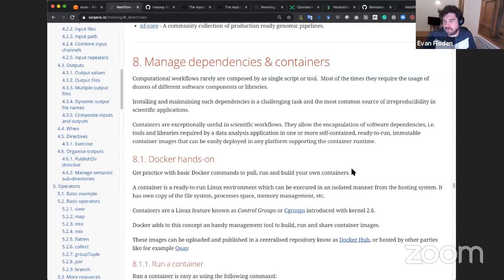When you run from GitHub, it's actually good practice to really have your pipelines working exactly like we have in this example, with some setup data that works, and then you can be guaranteed that anyone who uses that as a starting point for developing their pipeline can run it. And that's the whole philosophy around some of the nf-core pipelines as well, that they should just run directly from pulling them from any Git location. So we've seen how we can pull all the syntax together.